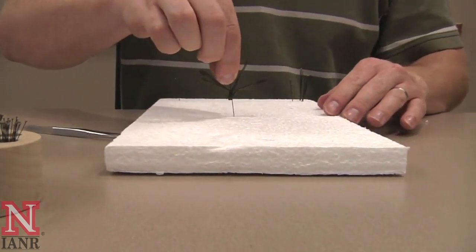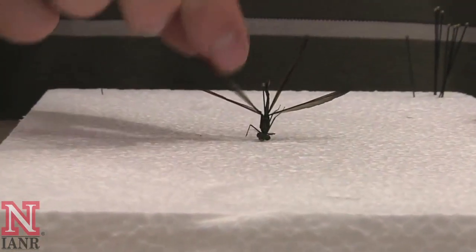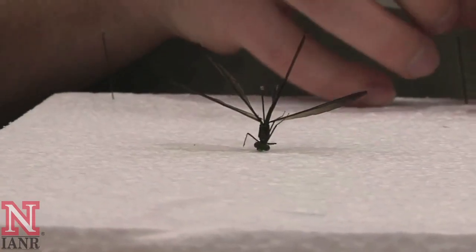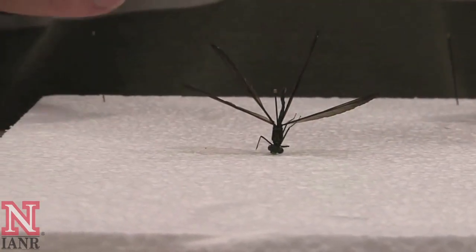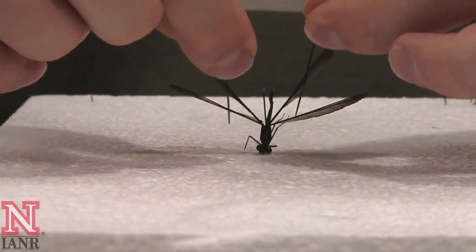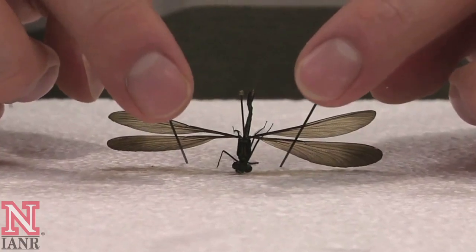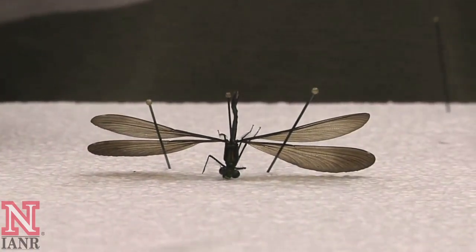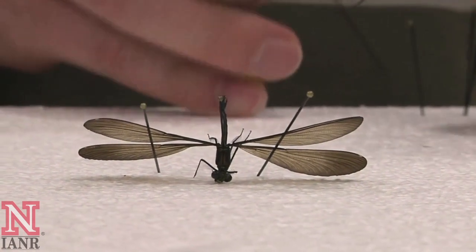Take your pinned damselfly and put it into a block of styrofoam so that the bottom of the body is flush against the styrofoam. Next, take pins to hold the wings down. With damselflies, the wing venation is very important for identification, so spreading the wings out in this manner would help a specialist in identification of the species.